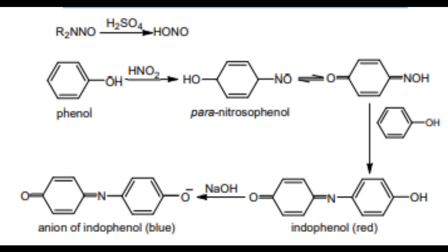Alkaline hydrolysis. Amides on hydrolysis with sodium hydroxide yield ammonia. Procedure. Take 0.2 g of the compound in a test tube and add 5 ml of 15% NaOH solution to it. Gently boil the contents of the test tube using a flame. The evolution of ammonia indicates the compound to be an amide or an imide.